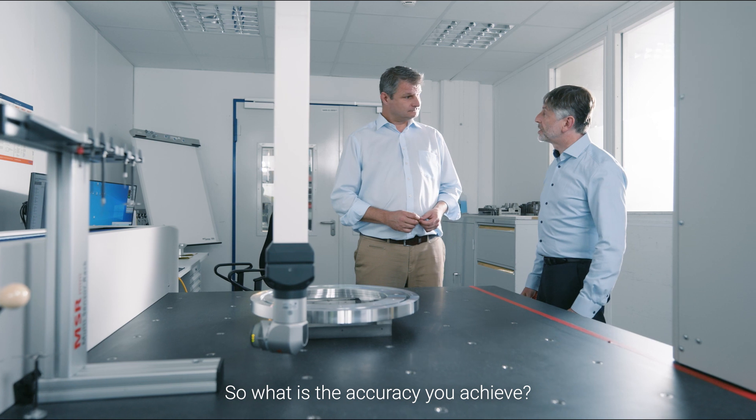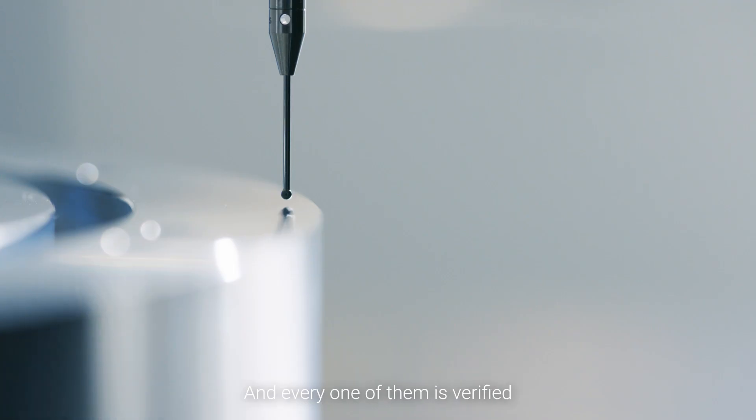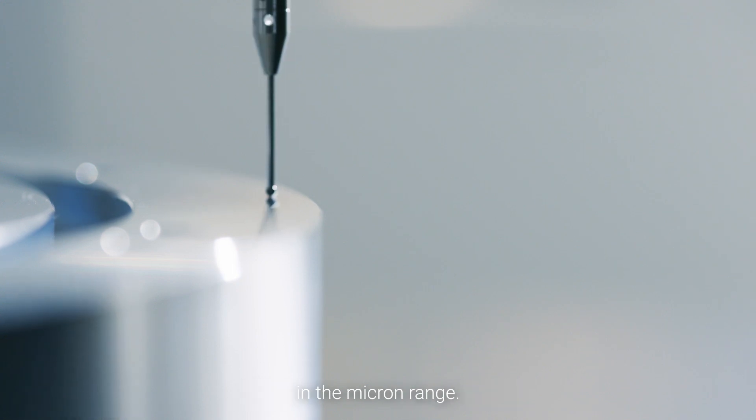So what is the accuracy you achieve? We're actually testing around 50 positions here and every one of them is verified in the micron range.